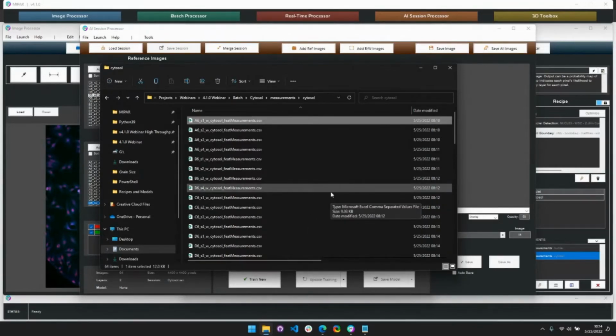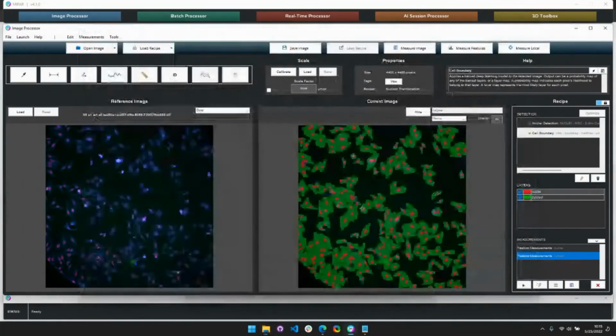Or you can use more powerful solutions, be able to take this data and transfer it into AI-based data mining, data analysis solutions, where they may be able to find some insight in the data outside of just the classical applications.